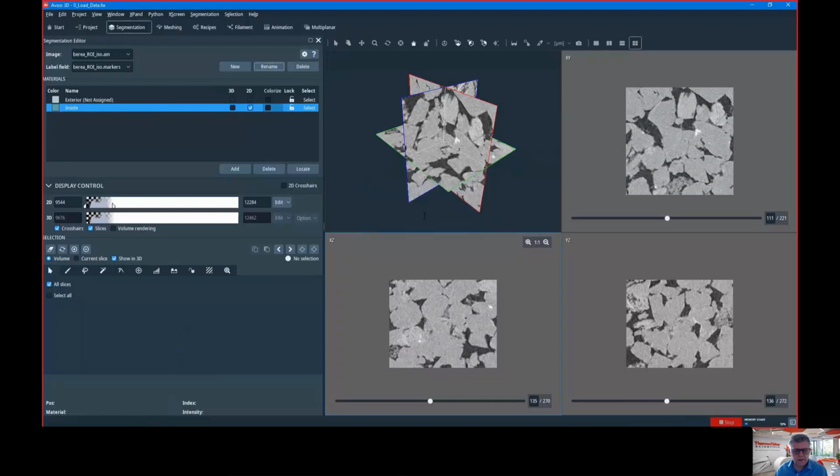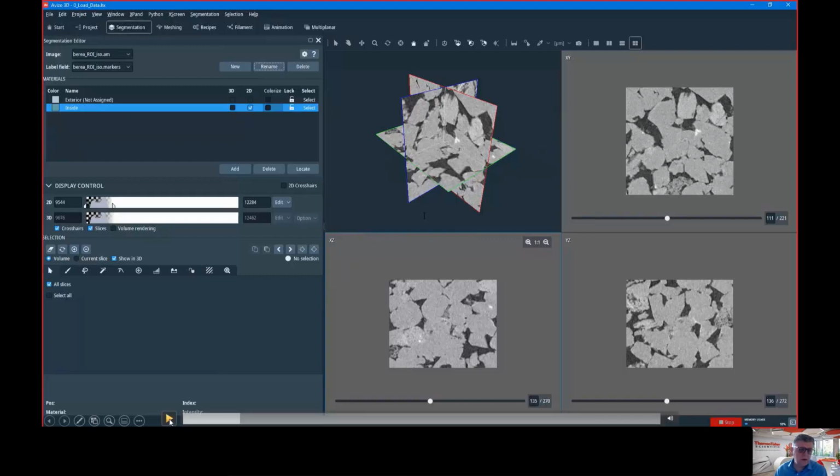I guess 80% of people know what it is, but I repeat it: instead of explicitly assigning the grain and the pore space precisely myself, I will let Watershed do the job. I will just put some tentative segmentation of the grain and of the pores, and then I will use the Watershed algorithm to expand these two phases, and they will meet at the border.